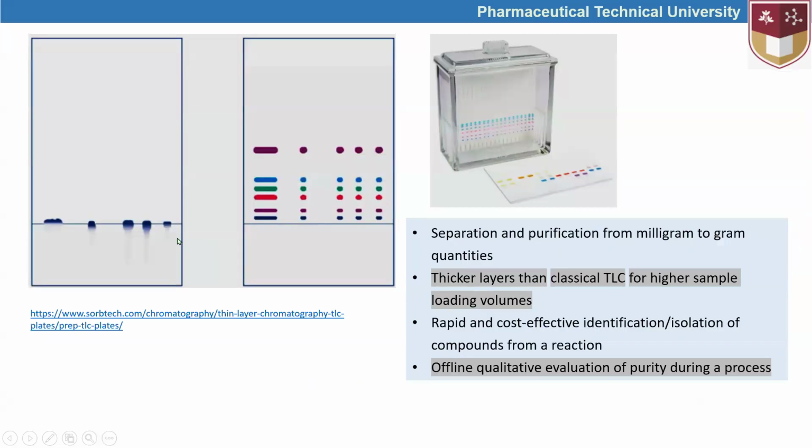And here we can see that if the extracts are located on the surface of the TLC plate in a wide dimension, then the lines can be wide like this. If it is small, then we can expect something like this.